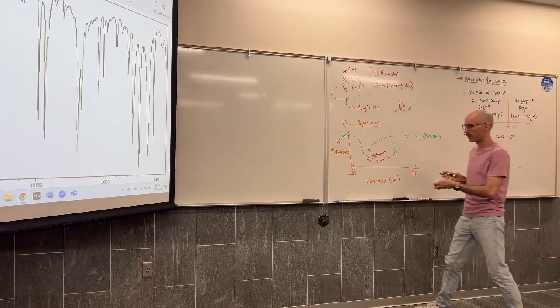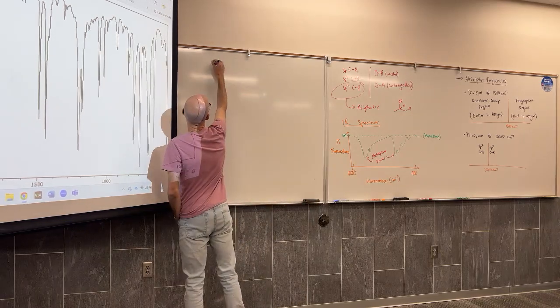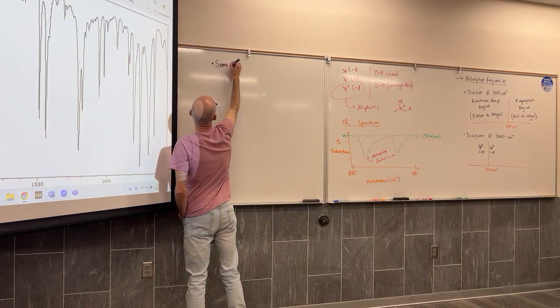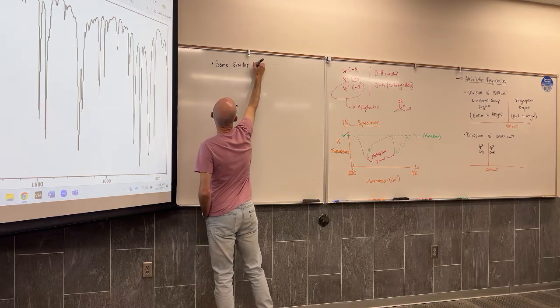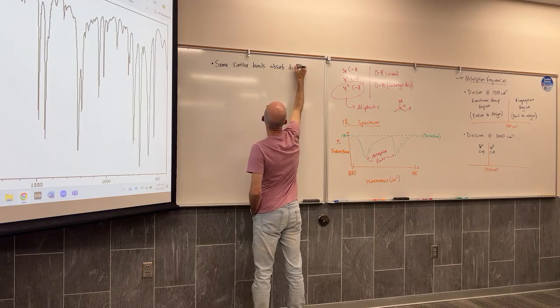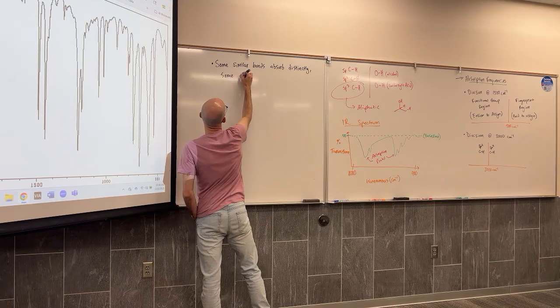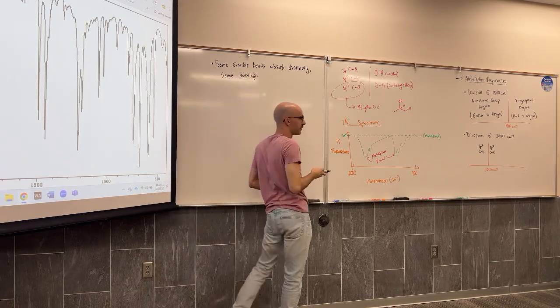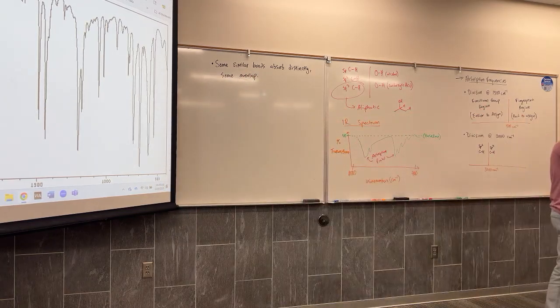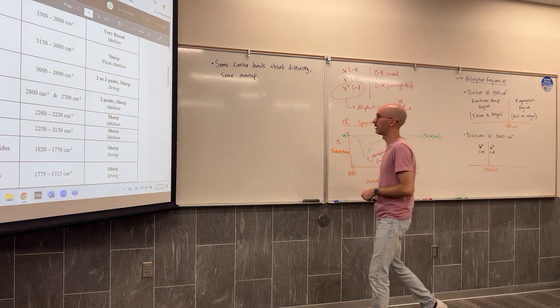The other thing that I want to say about absorption frequencies: sometimes similar bonds absorb very distinctly, sometimes similar bonds overlap. We've already hit this a little bit. I'll just give you this comparison.